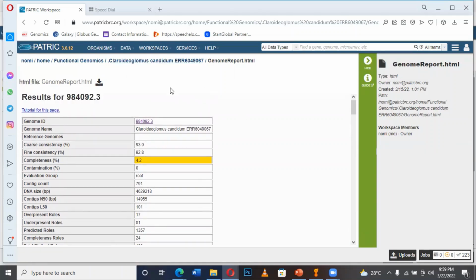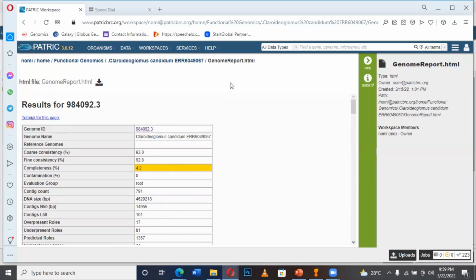So if you are given a genome sequence for you to annotate, or you are given any numbers, when making reports, this is what you actually need. Okay, these are some of the things you can actually write. So if you are working with maybe 4 to 5 samples, you just have to form an Excel table where you'll be able to present these numbers and report that as your main report of the work you did. All right, so now let's try to explore the genome itself.